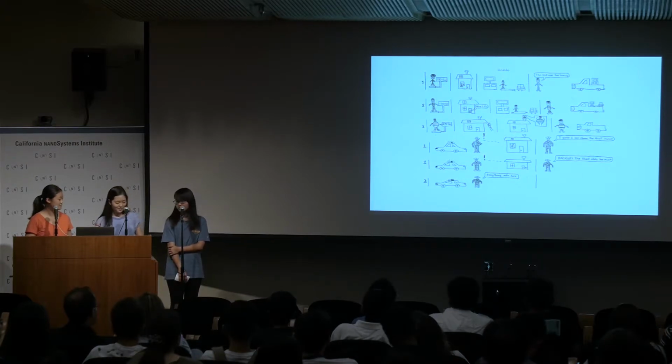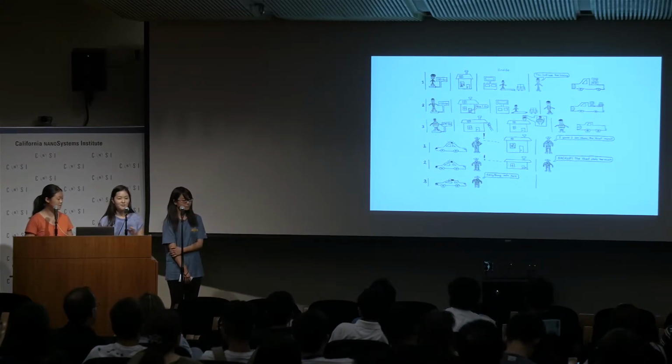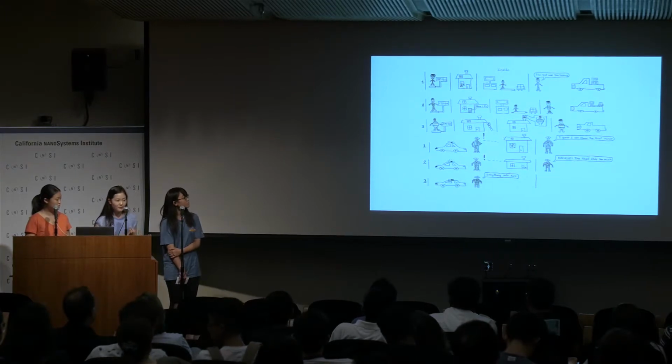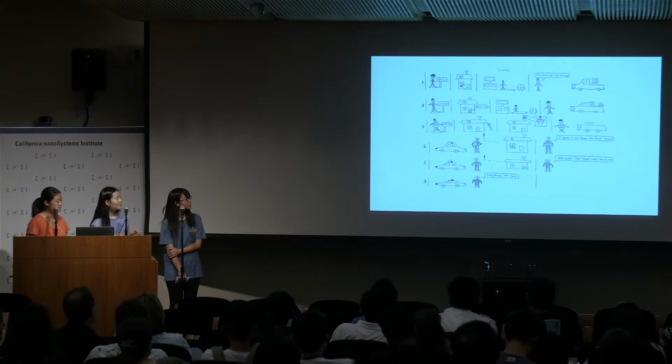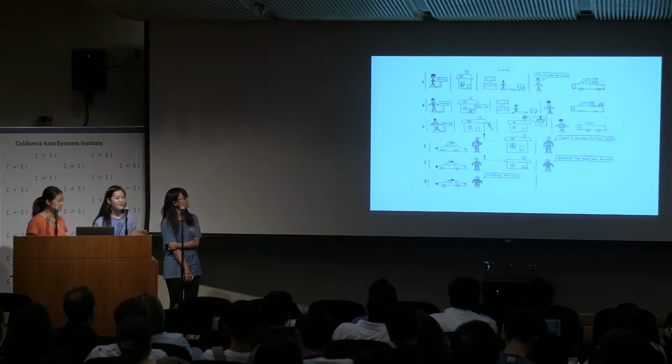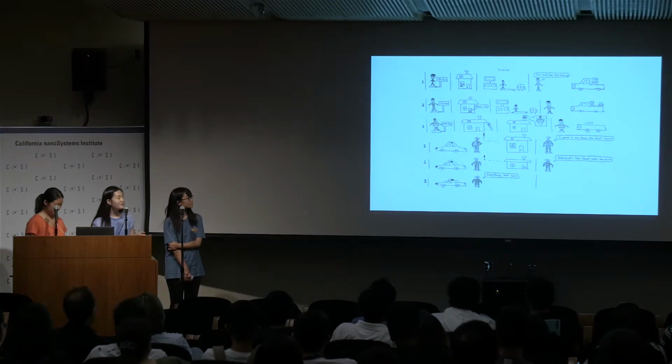So for our experiment, we basically used different forms of silver in order to kill yeast cells, and this was our way of measuring the toxicity of the silver. So the three different forms that we used were silver ions, silver nanoparticles, and silver powder. So in this drawing, you can see that the first robber, which weighs 120 pounds and is the lightest, represents the ions, which are the smallest. The second robber represents the nanoparticles, and the third robber, which is the biggest in weight, represents the silver powder.